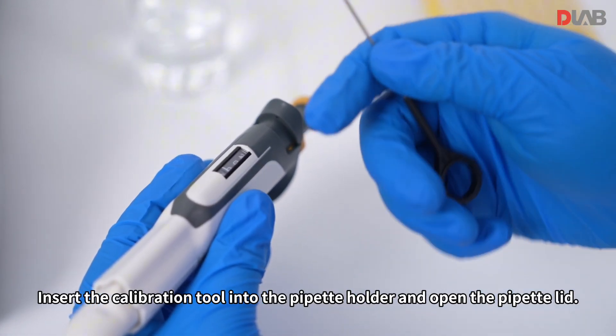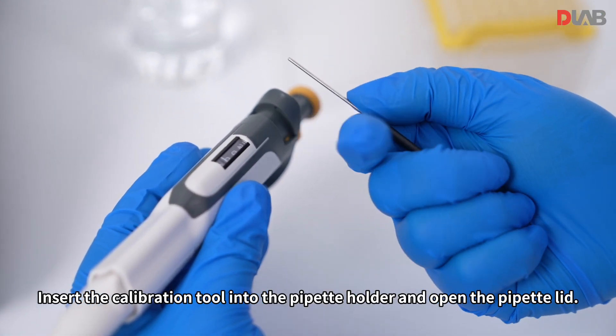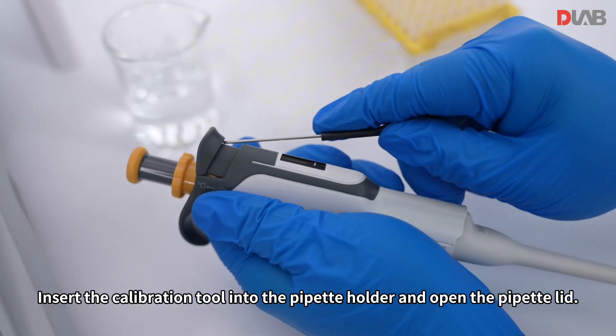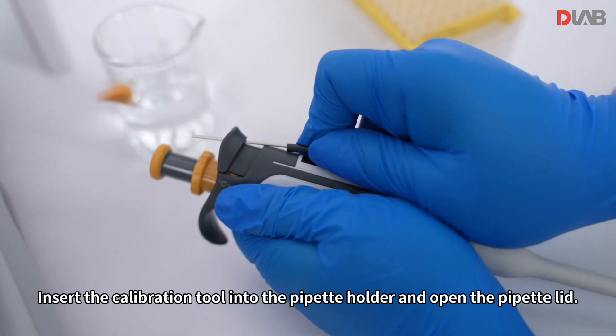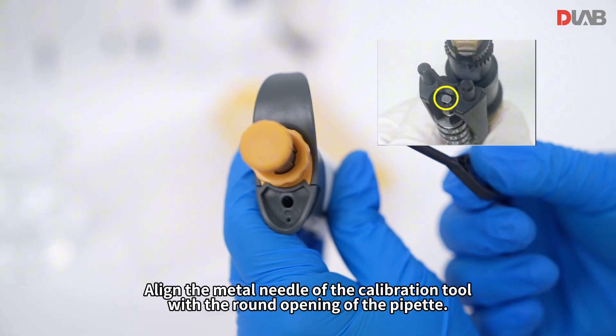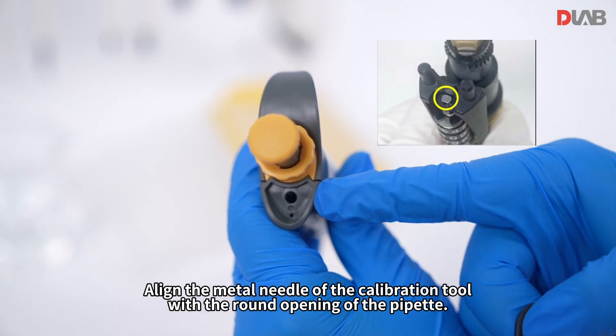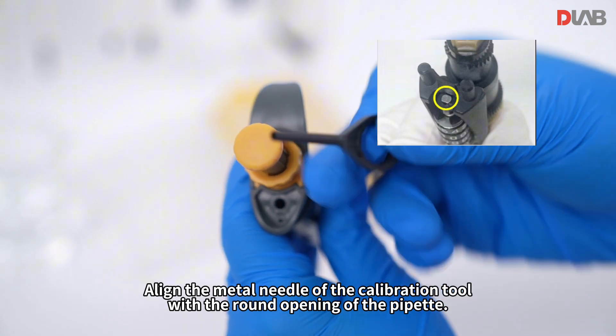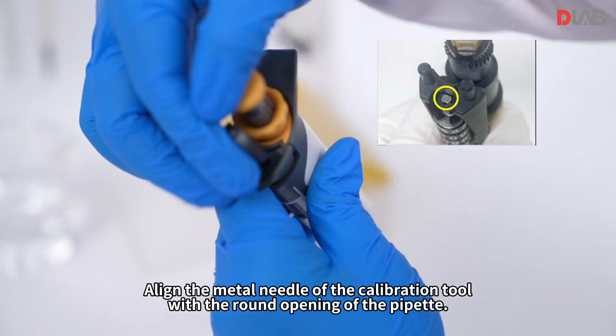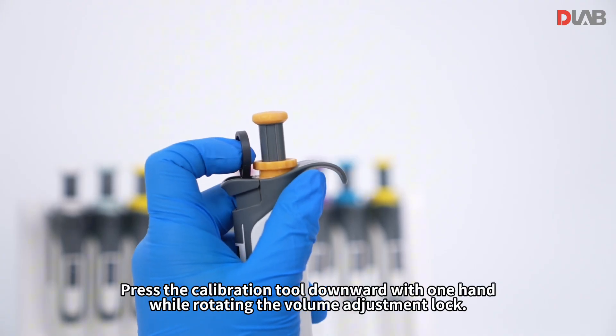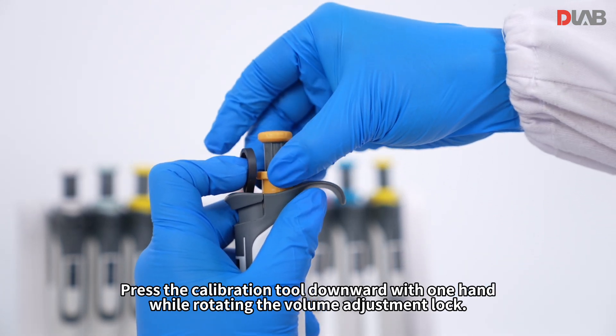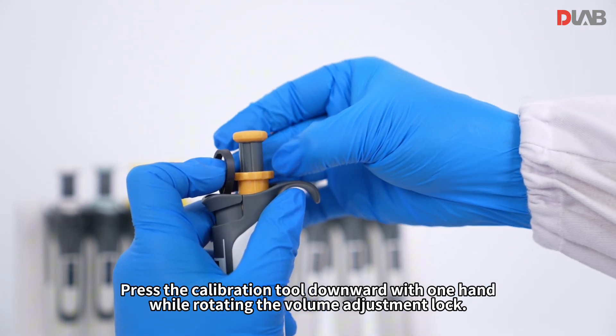Insert the calibration tool into the pipette holder and open the pipette lid. Align the metal needle of the calibration tool with the round opening of the pipette. Press the calibration tool downward with one hand while rotating the volume adjustment lock.